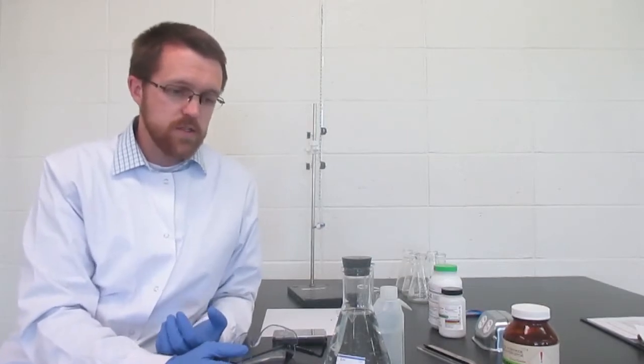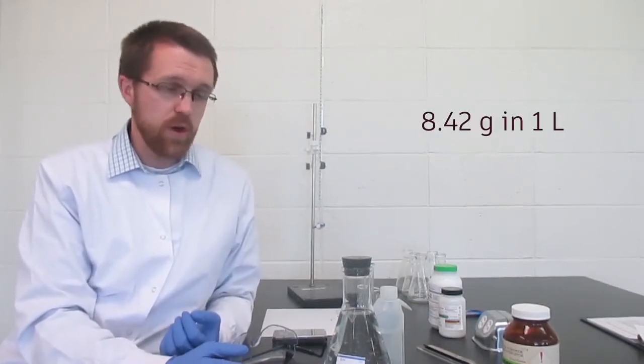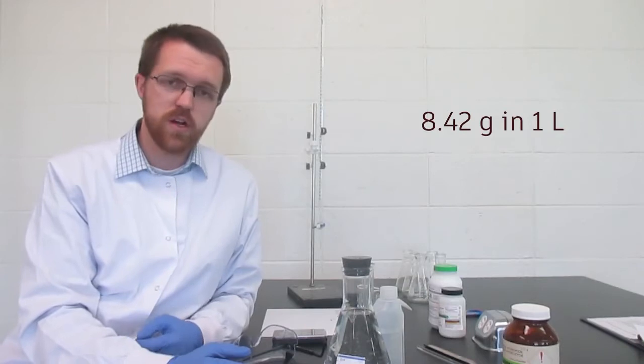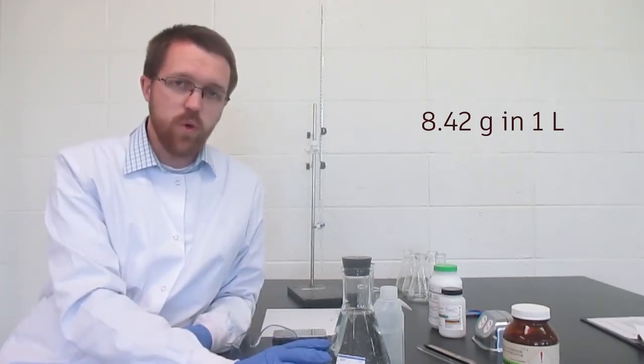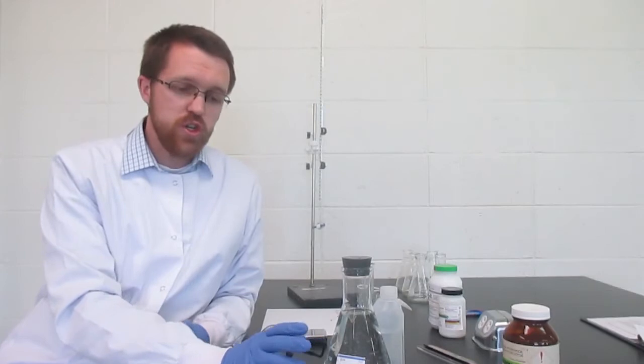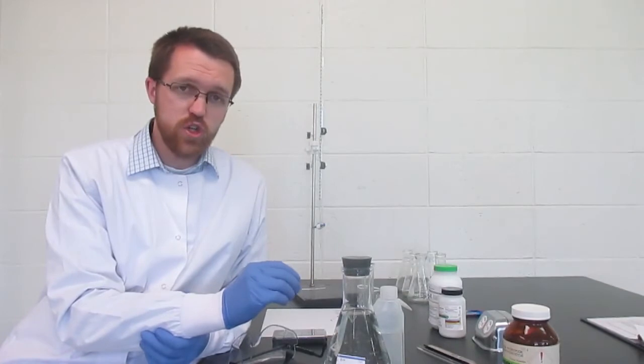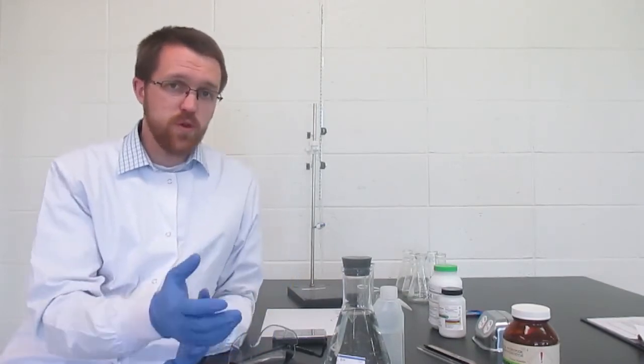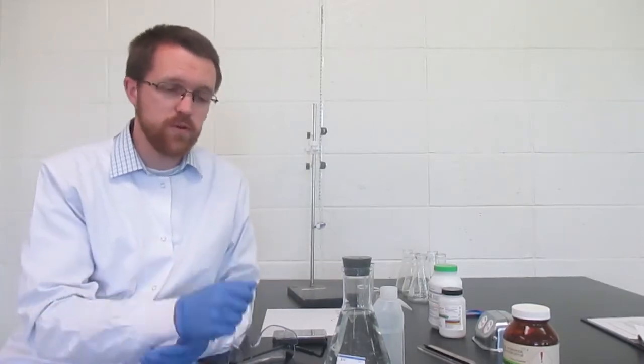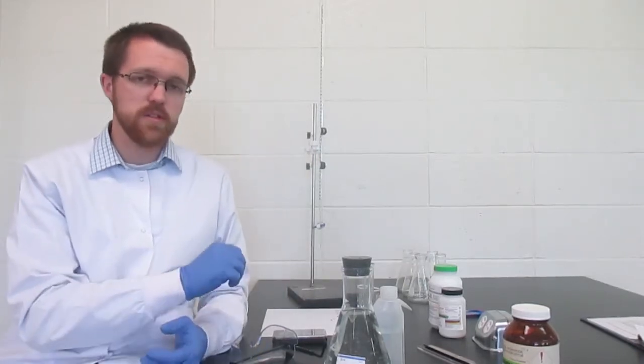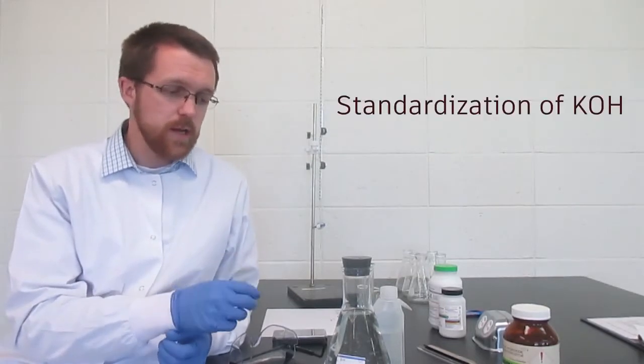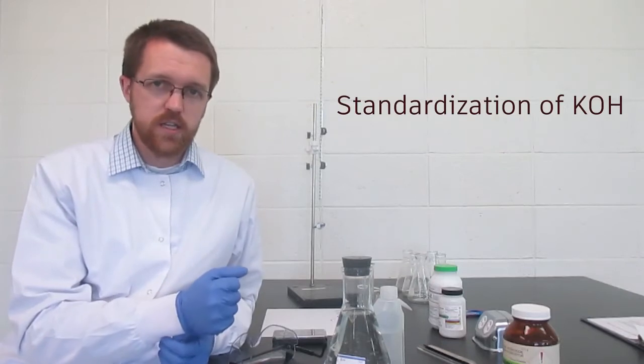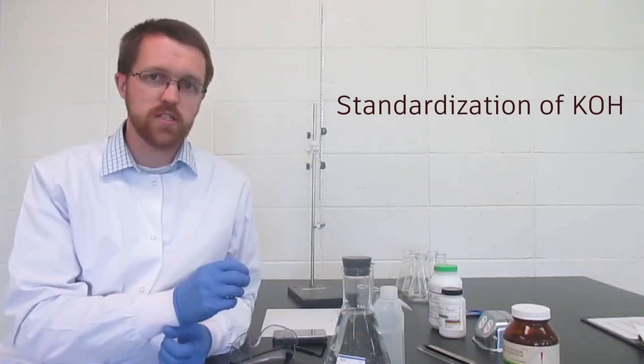So what I did was I dissolved 8.42 grams of potassium hydroxide pellets in about a liter of water, which should get us, assuming it was all potassium hydroxide, about 0.15 moles per liter. But again, I don't know if that 8.42 grams was all potassium hydroxide or if there was some water in there. So that's the purpose of this lab in figuring out the concentration of the potassium hydroxide. We call that standardization, so we're standardizing the potassium hydroxide.